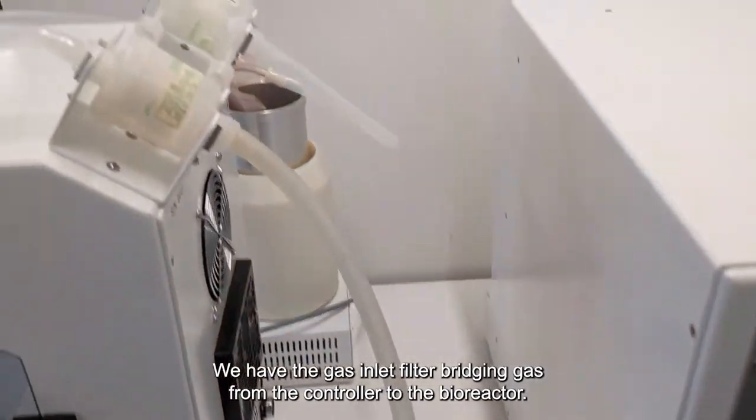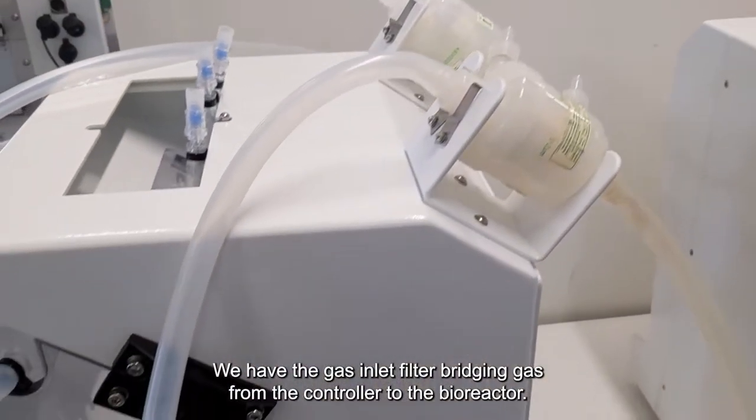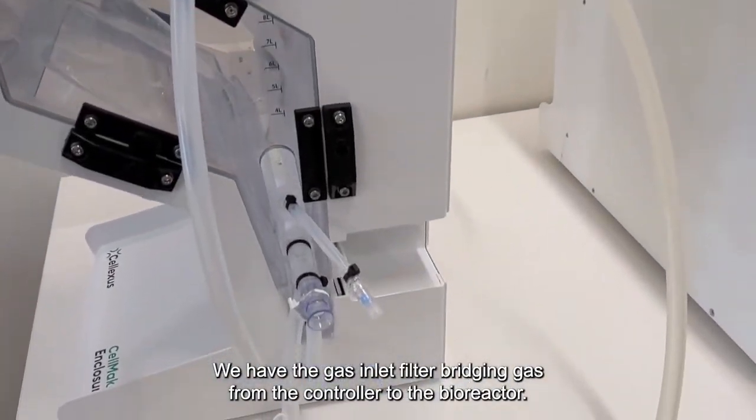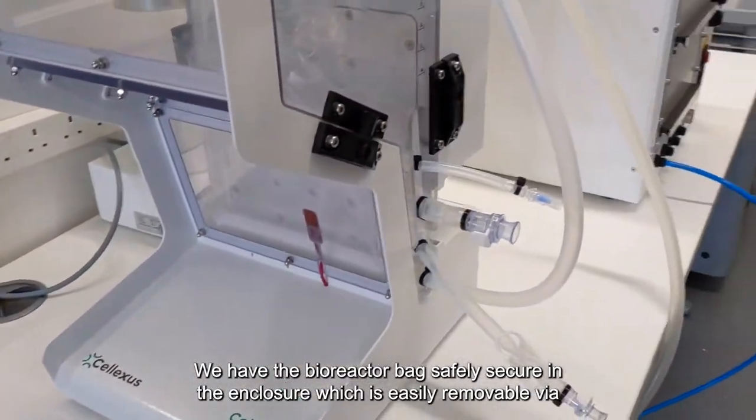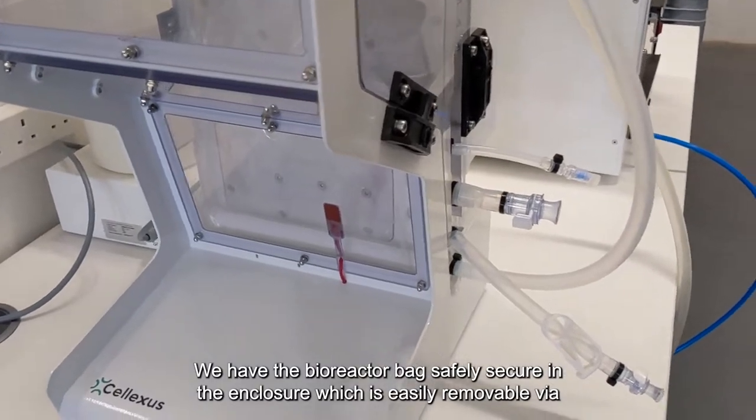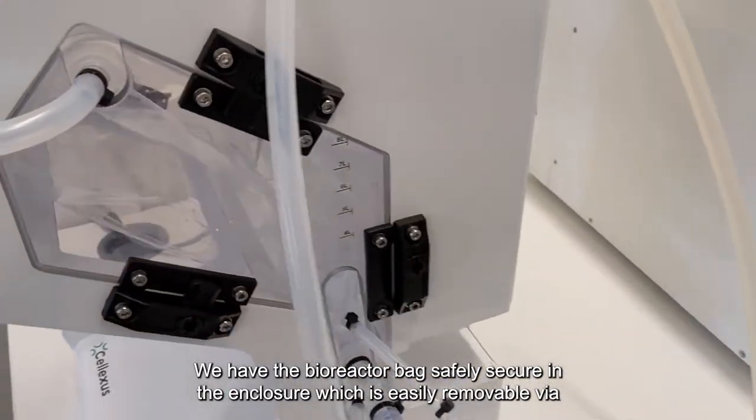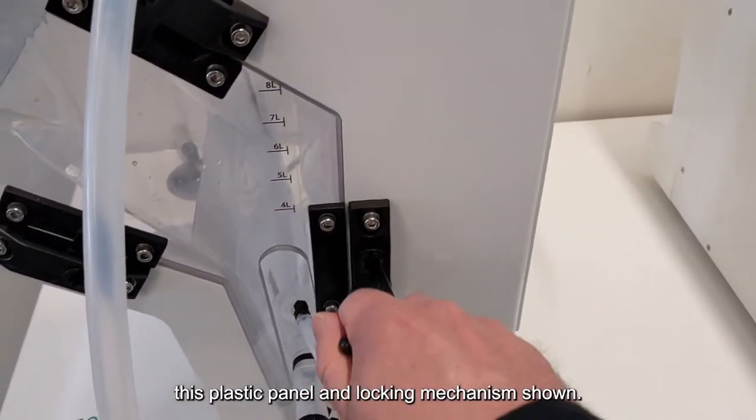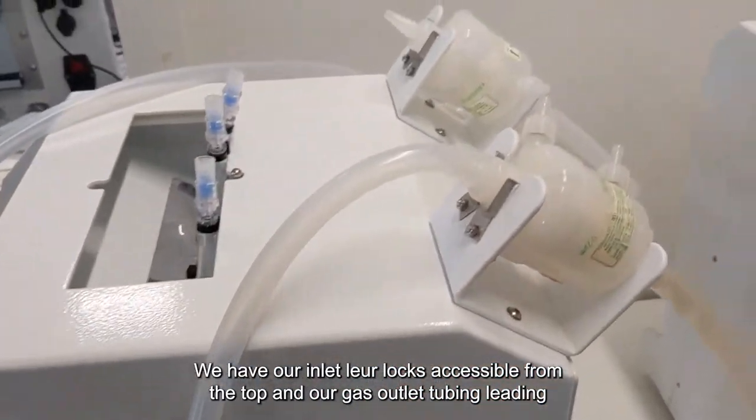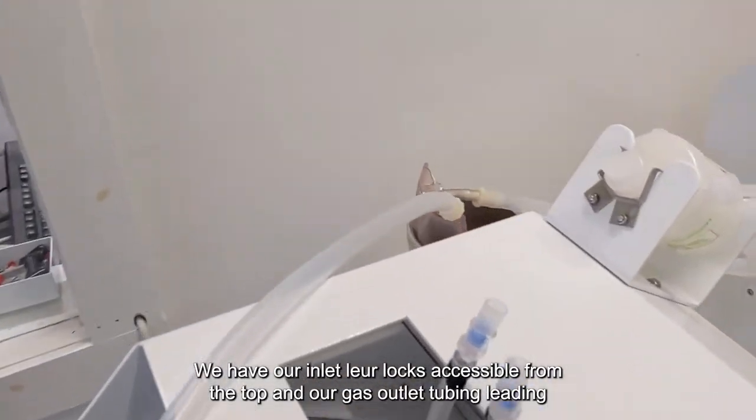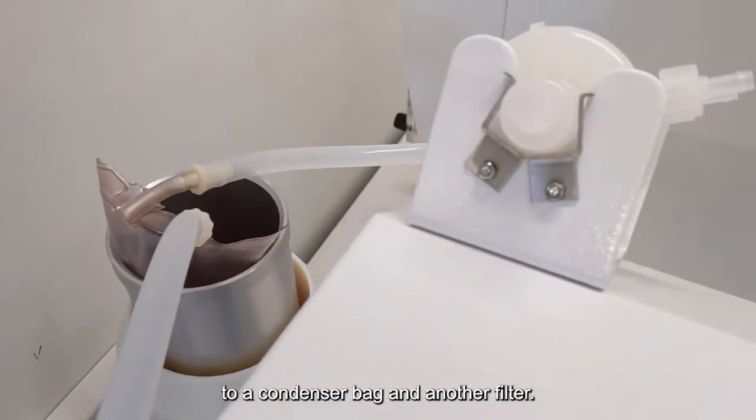We have our gas inlet filter bridging gas from the controller to the bioreactor. We have the bioreactor bag safely secured in the enclosure, which is easily removable via this plastic panel and locking mechanism shown. We have our inlet luer locks accessible from the top, our gas outlet tubing, leading to a condenser bag and another filter.